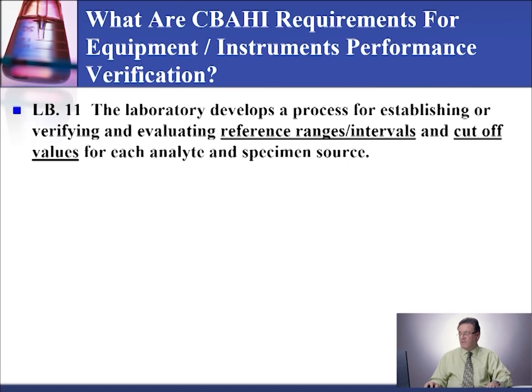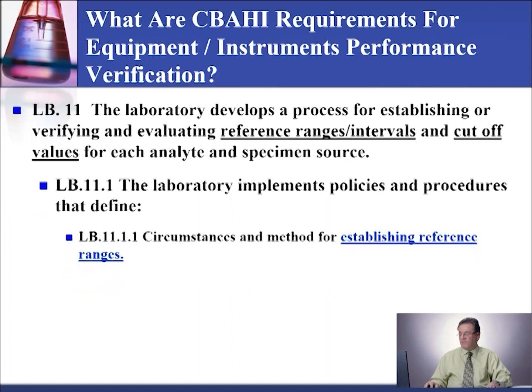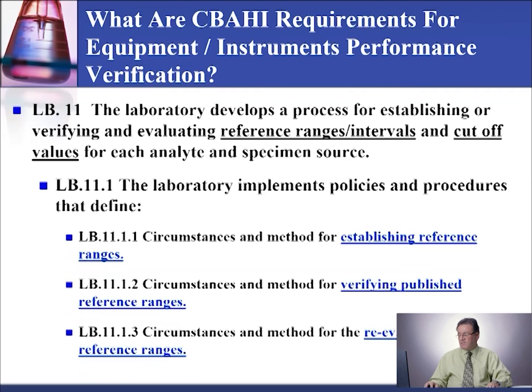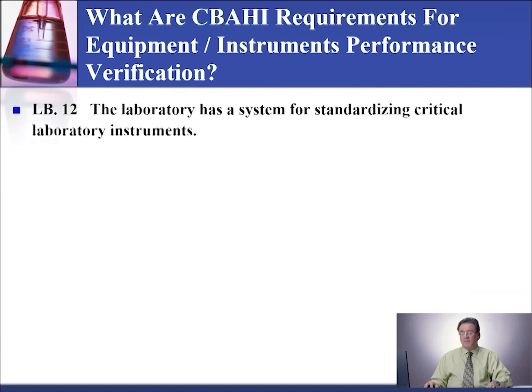Routine, simple equipment may not require all of the OQ testing elements I'm going to mention to you. For some software functions, such as archiving, the manufacturer's recommendations and instructions need to be followed. OQ tests are specifically designed to verify the instrument operation according to manufacturer specification in the user's environment.